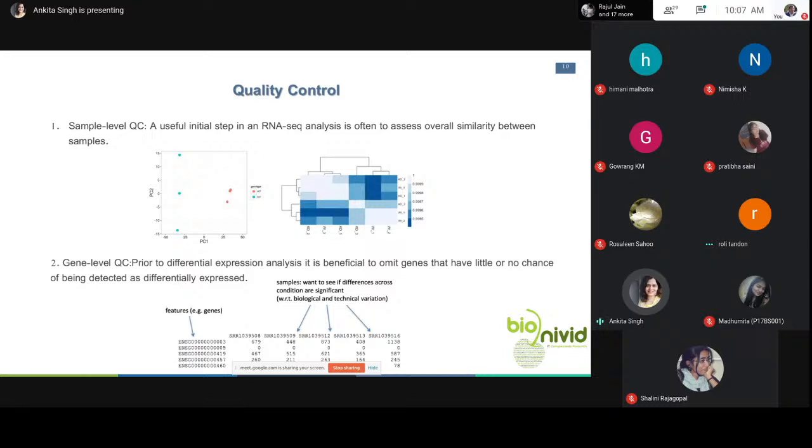We see that if two samples are well correlated, it should have a correlation value between 1 and 0.9. We can expect 10% values getting here and there, but at least it should be 90% correlated.